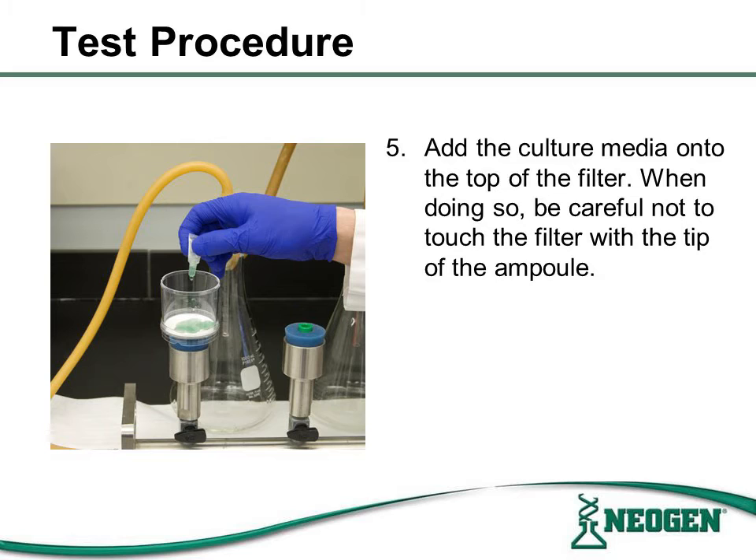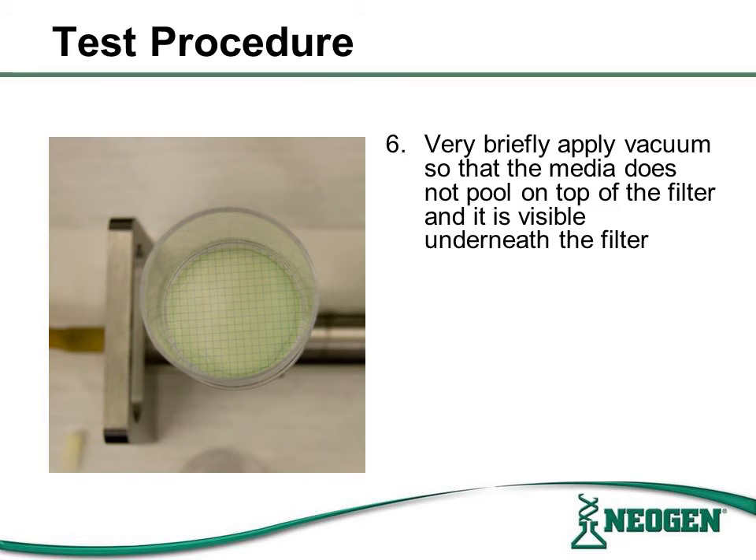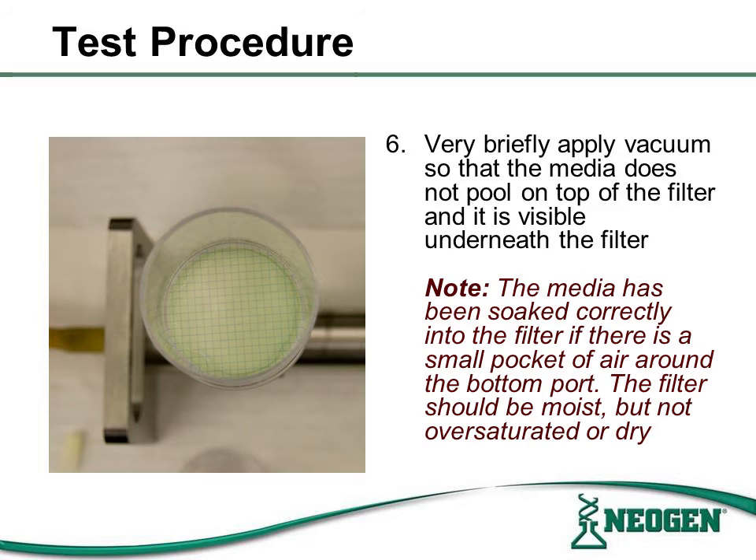Now add the culture media from the ampule to the top of the filter. Be careful not to touch the filter to the tip of the ampule. Please note to try and spread the media evenly over the filter to avoid pooling. If the media pools on top of the filter, this would allow for uneven distribution of growth support with sporadic colonization. After the media has been added to the top of the filter, briefly apply the vacuum so that the media does not pool on top. Note that the media has been soaked and filtered correctly if there is a small pocket of air around the bottom port. The filter should be moist but not oversaturated or dry.